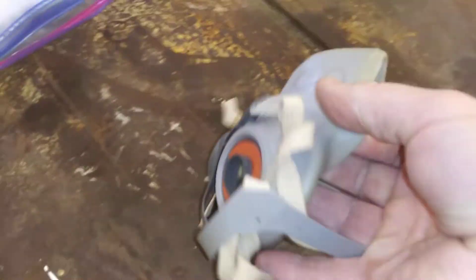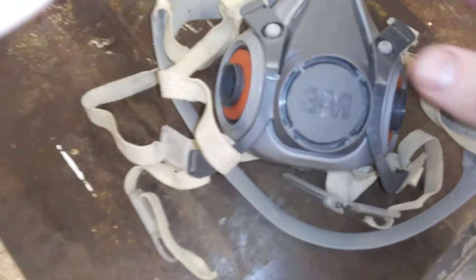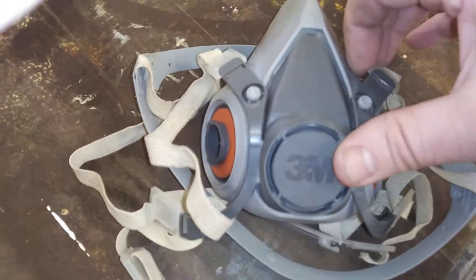Here is a normal 3M mask. The proper way of cleaning this thing: you'll need some sort of alcohol wipe or clean it in hot water and dish detergent.